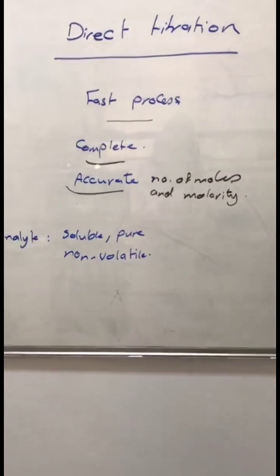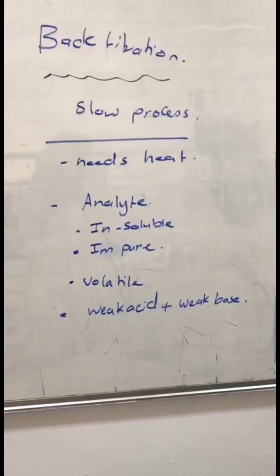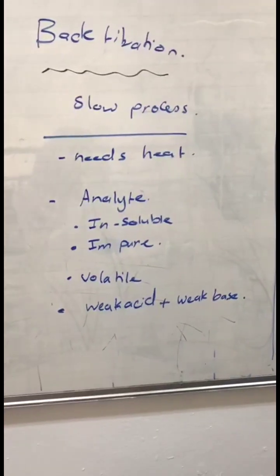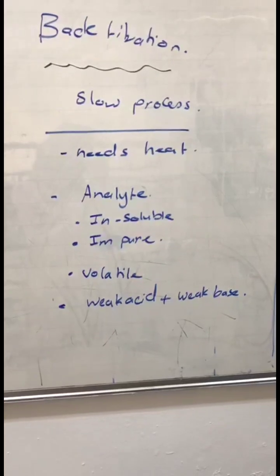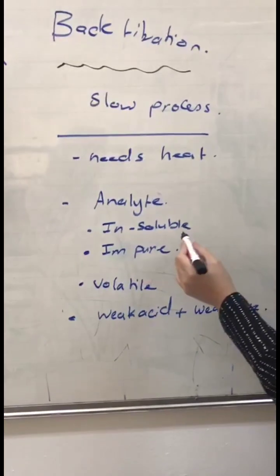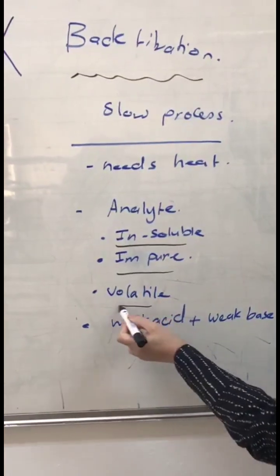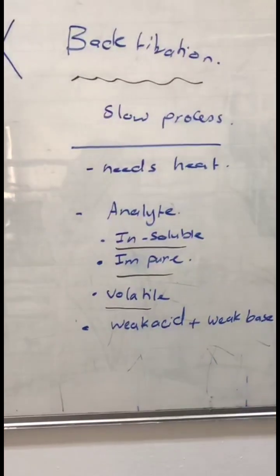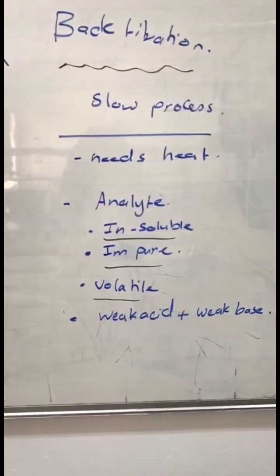For the back titration, which we are going to study today, it is described as a slow process, it needs heat. The analyte that is used in the back titration would be insoluble, impure, volatile, or it is the reaction of weak acid plus weak base.